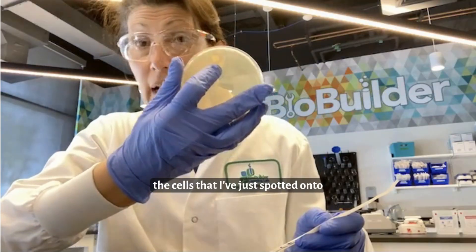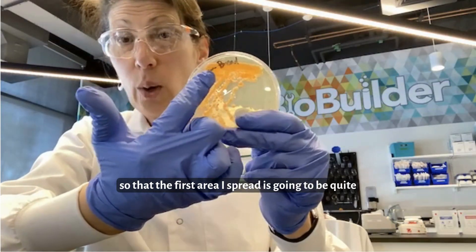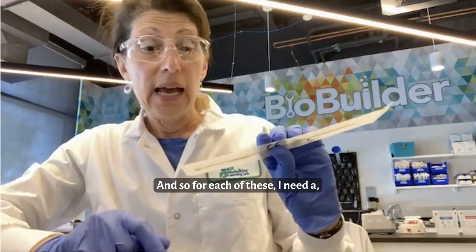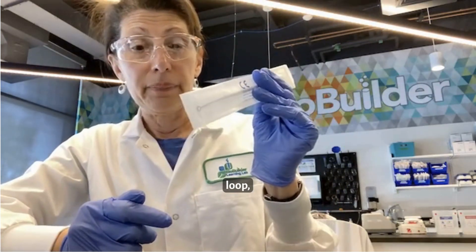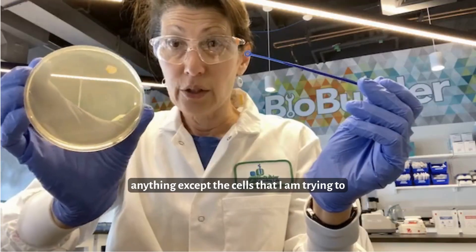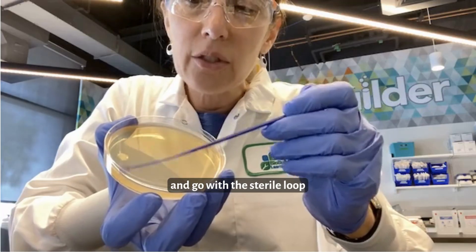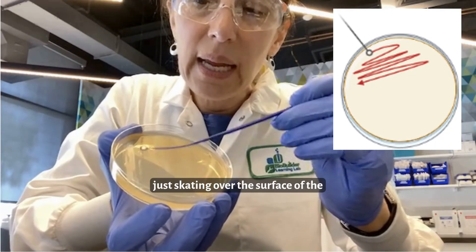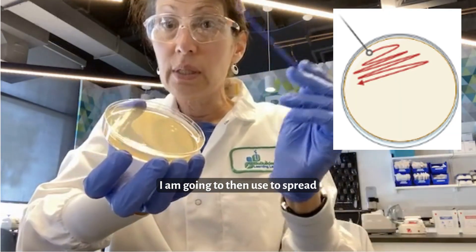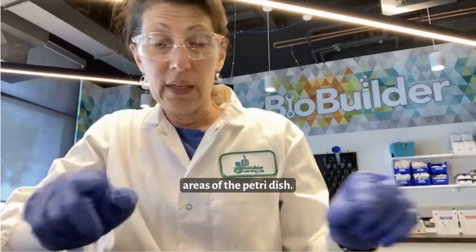The cells I've just spotted onto this petri dish, I'm going to want to spread them out and effectively dilute them so that the first area I spread is going to be quite dense, then the next area will be less dense, and the final area will, I hope, have single colonies. For each of these I need a single new loop. I'll open the loop, not touch it to anything except the cells I'm trying to streak, and go back and forth across the spot of yeast, just skating over the surface of the petri dish and ending with a small section to use for the next spread.